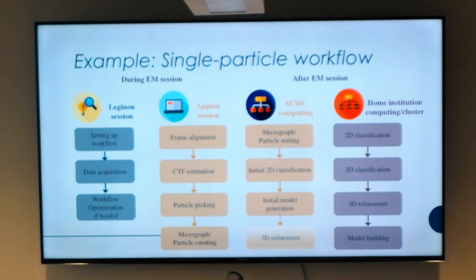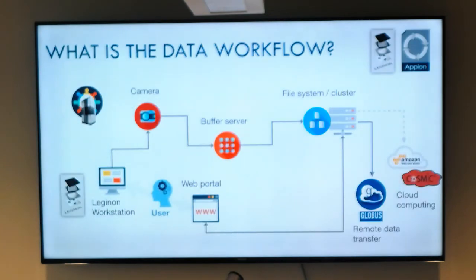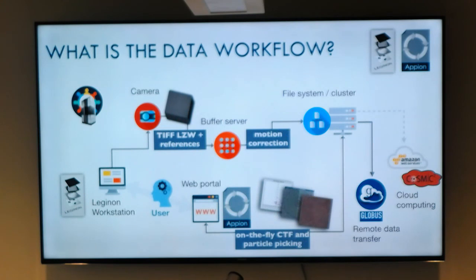In this particular workflow, we are already assuming that you're making use of this pre-processing. I did mention that if you want to do particle polishing and the rest, you do have access to the movies, and in that case you probably would want to go all the way back, because by default we only do 5 by 5 patches. Right now people have shown that, as a balance between time and GPU resources, 7 by 7 might be more towards where people may want to go.